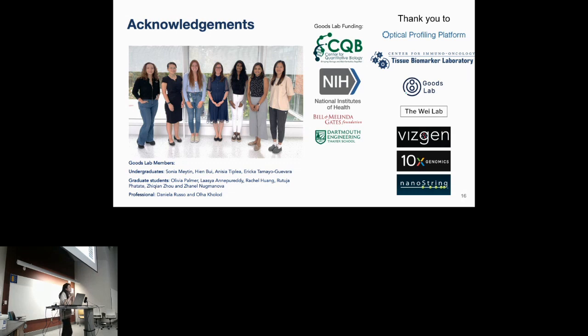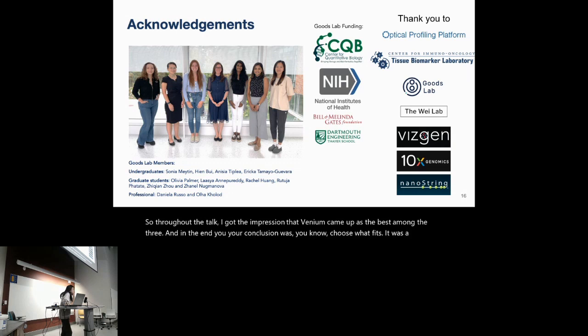So throughout the talk, I got the impression that Xenium came up as the best among the three. And in the end, your conclusion was to choose what fits. It was a non-committal conclusion. Is there any particular evaluation where CosMx was clearly the best?